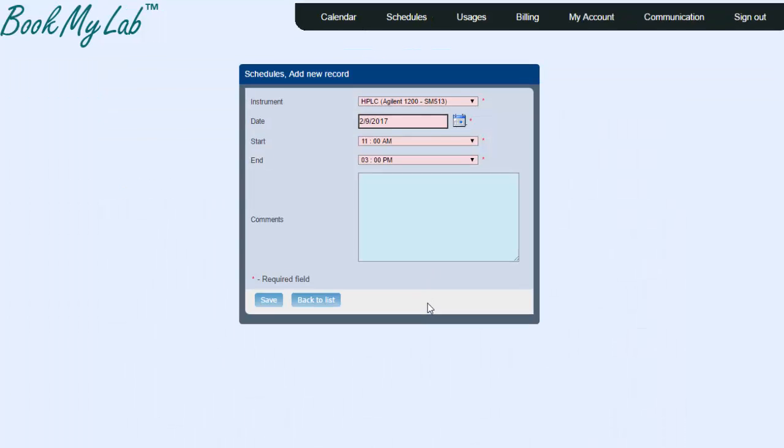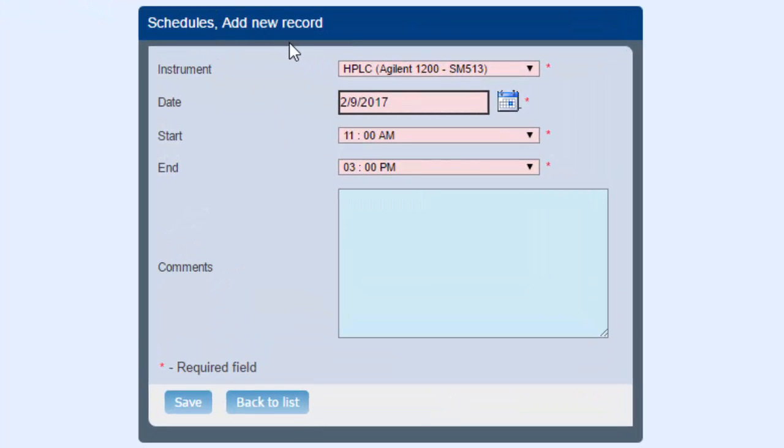That'll bring you to a page that says Schedules Add New Record. At this point you can confirm that the instrument choice is correct, that the date is correct and that the start and end time of your reservation is correct. If you are a student user, in the comments section please add the last name of your faculty advisor and then click save.